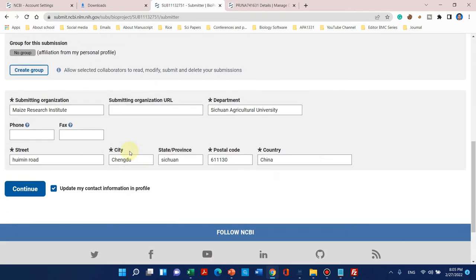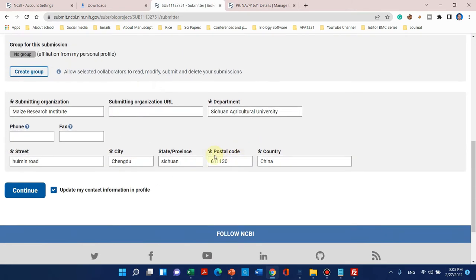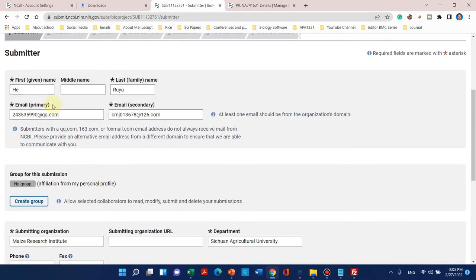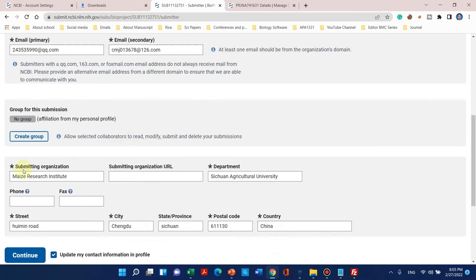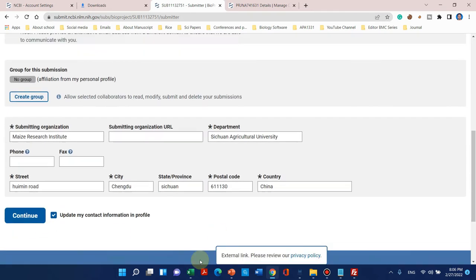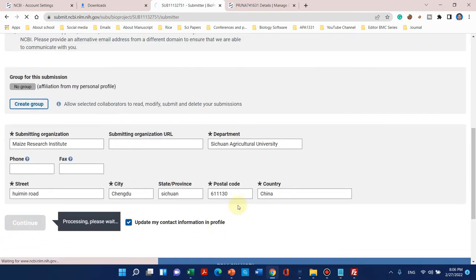Here is the information we have already used: first name, last name, email. The mandatory fields include submitting organization, department, street, city, postal code, and country. You can simply continue. From the project type, we can tell them what this project type is related to — because this is transcriptome data, we can click on that option. The sample scope can remain as mono-isolate. So we can just continue.